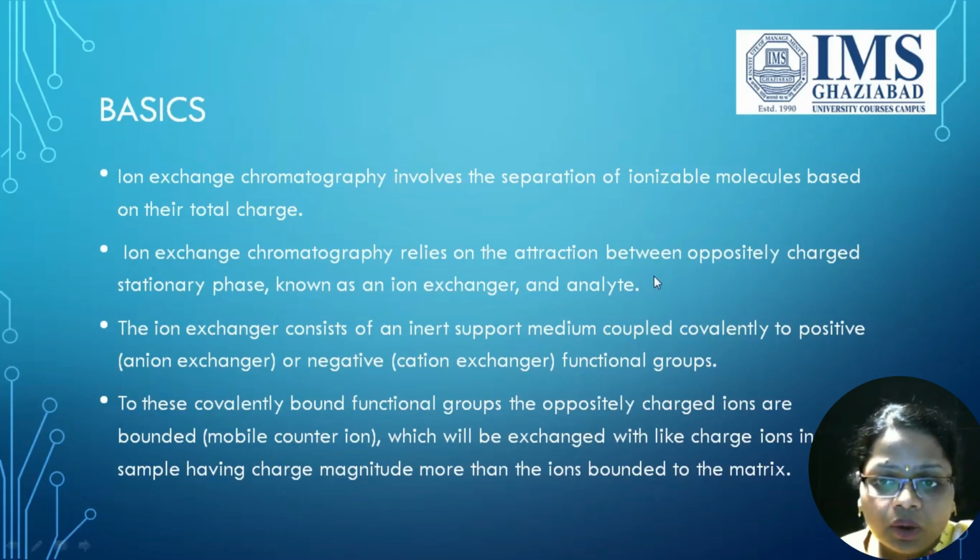Means we have two things. First is the stationary phase, which is, suppose for example, positively charged. So this stationary phase will have attraction for an analyte which has to be oppositely charged. Means in case the stationary phase is positively charged, the analyte will be negatively charged.